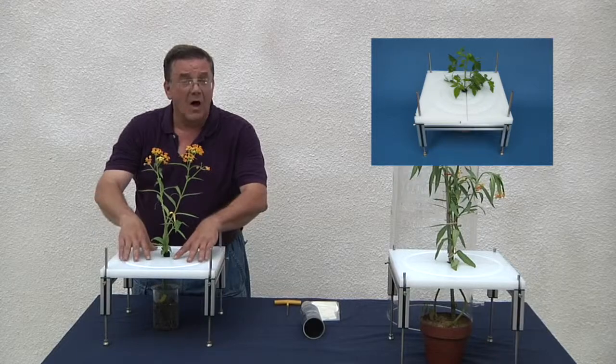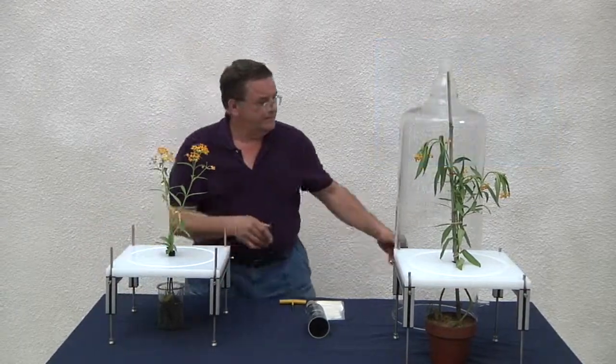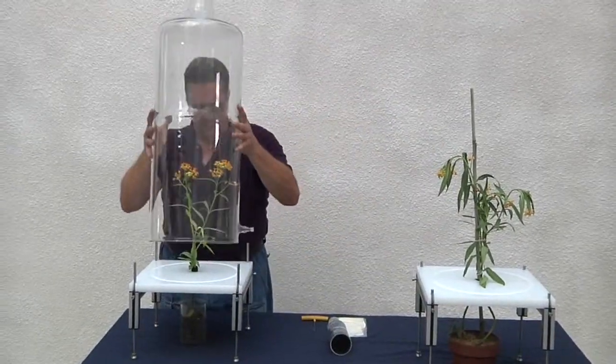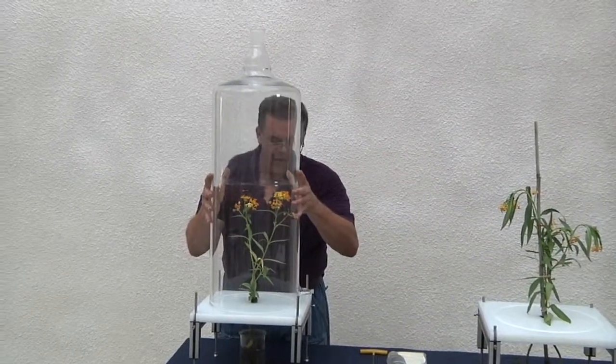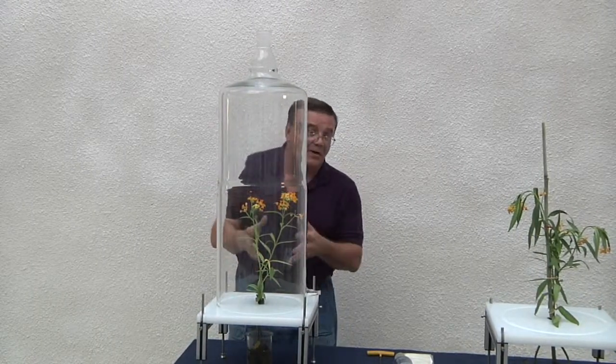Once we have our plant specimen locked into the guillotine stand, we can add our chamber. The chamber I'm using right now is one of our largest. It's 300 millimeters in diameter and over 600 millimeters tall. It can accept a much larger plant than the one I'm using here. This is also our new ambient air system.